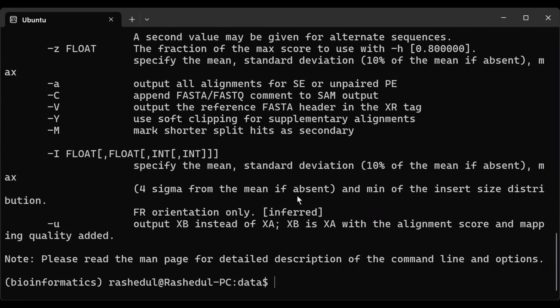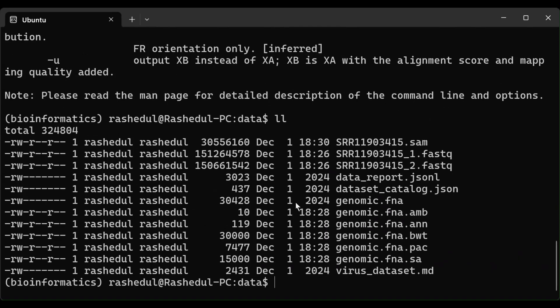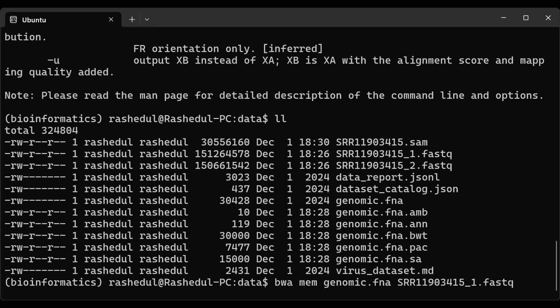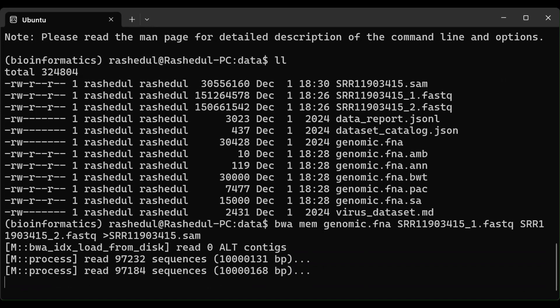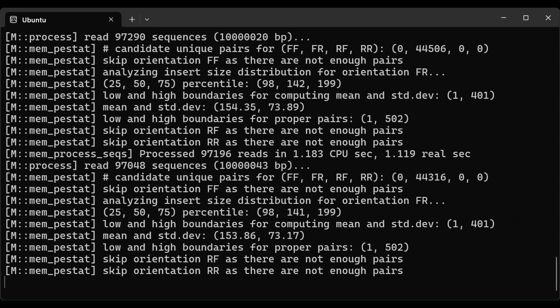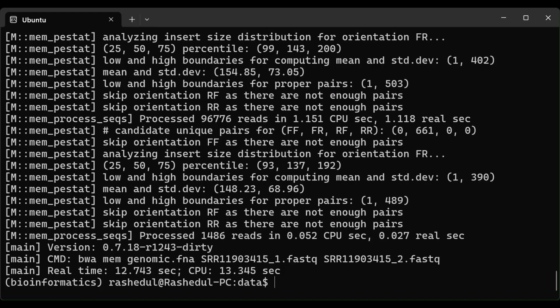After creating the index, we will align the reads to the reference genome using the bwa mem command. Here are the usage details — to align using bwa mem we need to provide the genomic file, then the first read, and then the second read. We also want to write the output in SAM format. This command will align the reads and save the results in a SAM file. Let's press Enter — BWA is performing alignment. Depending on the size of the genome and the number of reads, the runtime could vary. BWA has finished running.